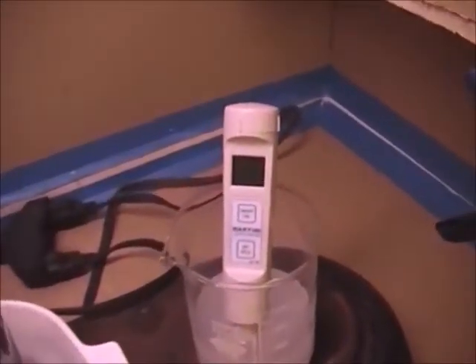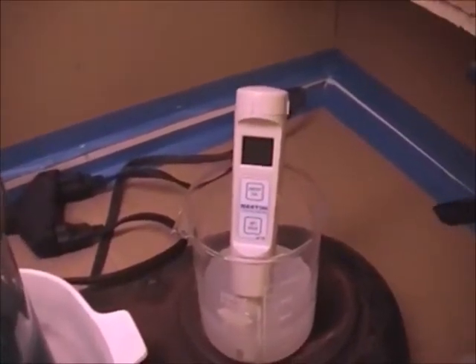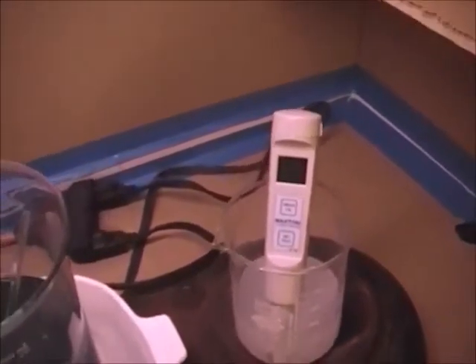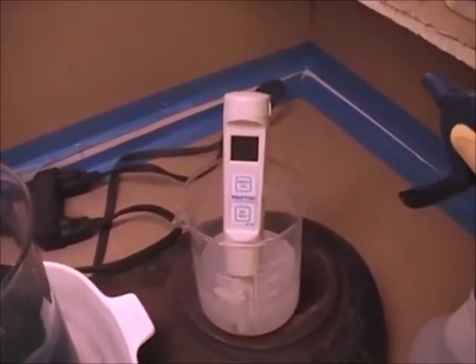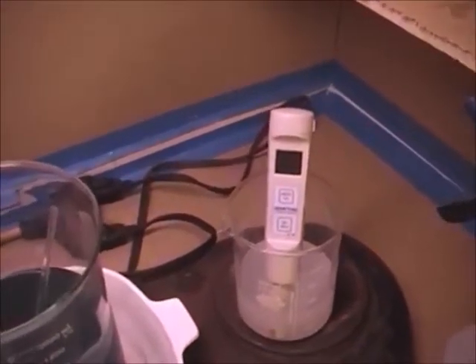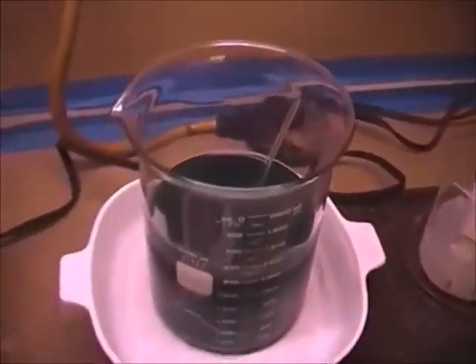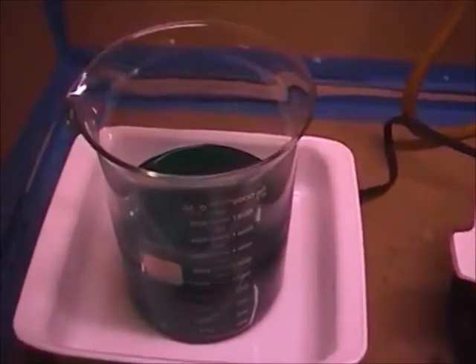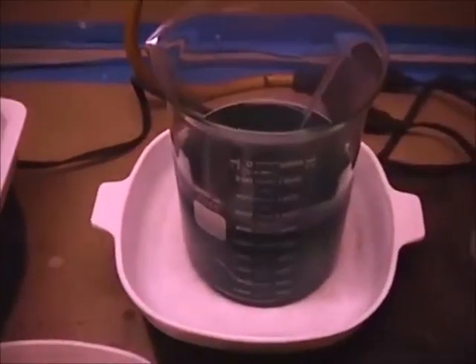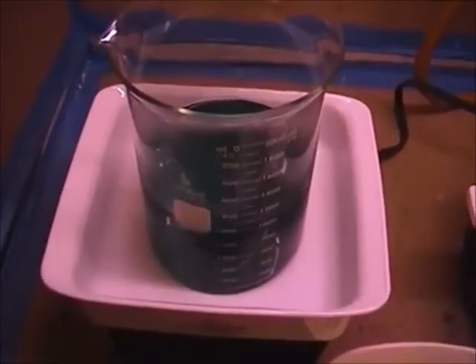And down here we have our pH meter, and this is going to be the last time that we use our pH meter. After that, we'll test with salt water to see how much silver may be left in the solution. But first I'm going to show you what the temperature of this solution is, and what the pH of this solution is. The pH actually rose more than I wanted it to. Our pH at the present time seems to be sitting around anywhere from 2 to about 2.3. The difference between these two beakers is only a little bit, but we're going to precipitate at that range.